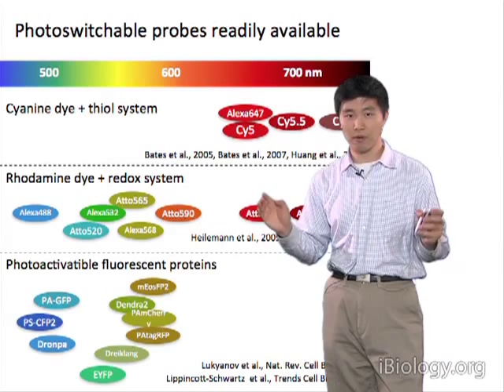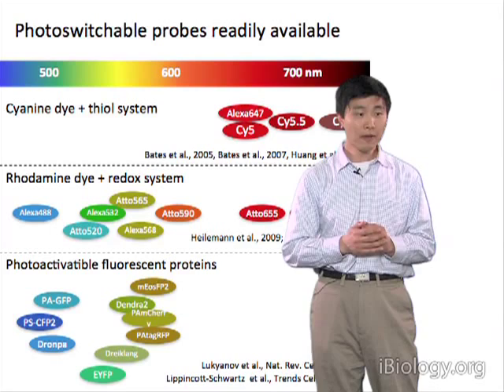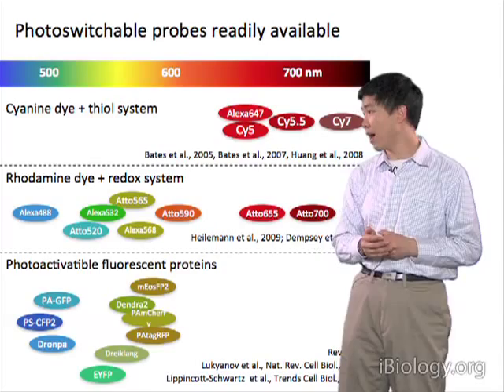That goes back as early as 1997, when W. Moerner discovered that EYFP is photo switchable. Recently there have been a lot of them coming out, almost one every 2 months. I'm showing you one example of these photo switchable dyes.